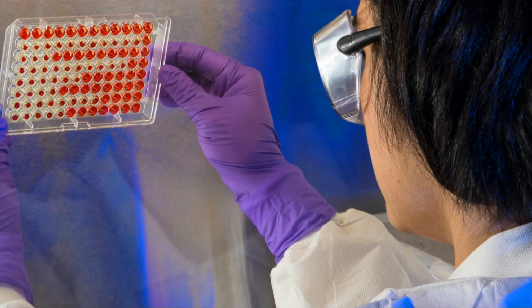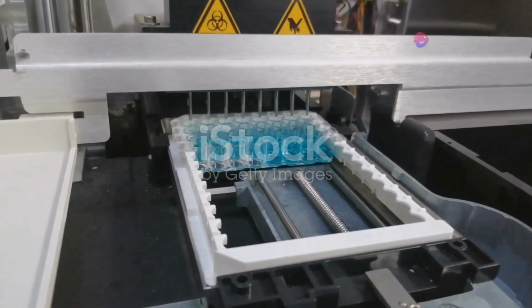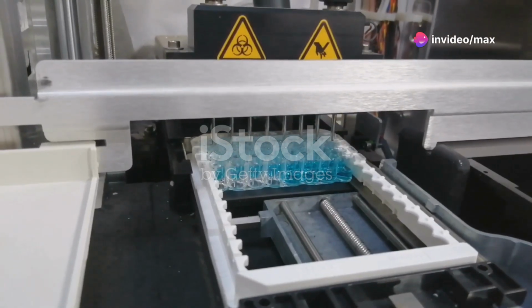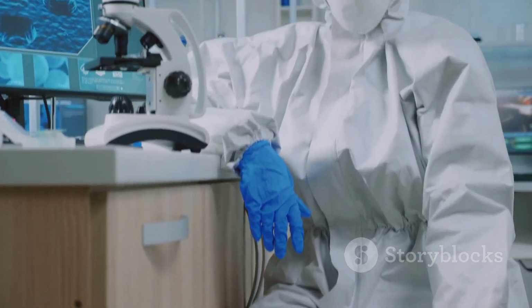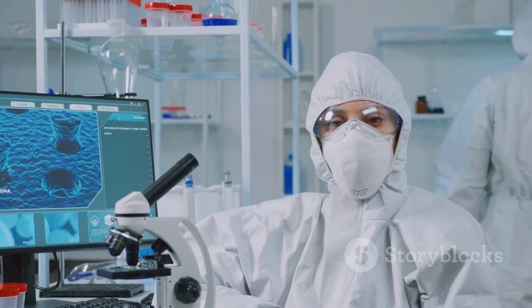ELISA, short for Enzyme-Linked Immunosorbent Assay, is like a detective's toolkit for identifying tiny but important molecules called antigens. These antigens can be anything from viruses to hormones, and ELISA helps us track them down with incredible precision.